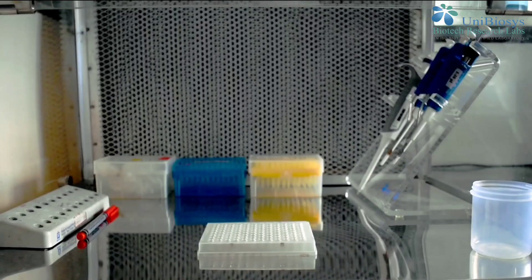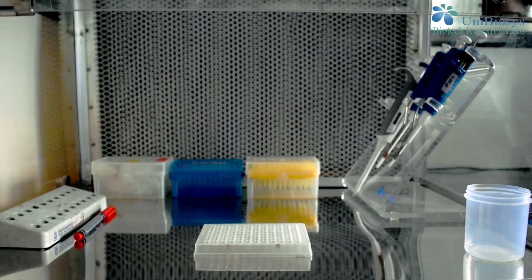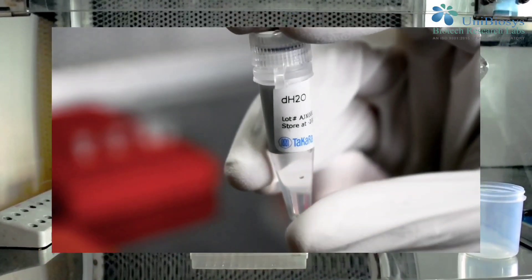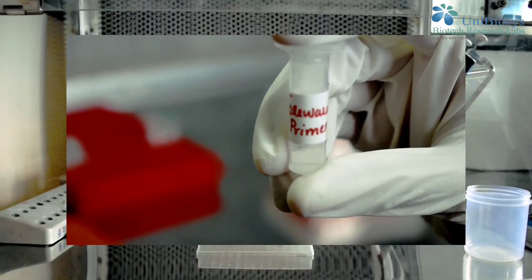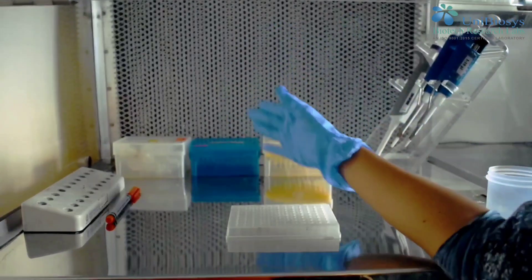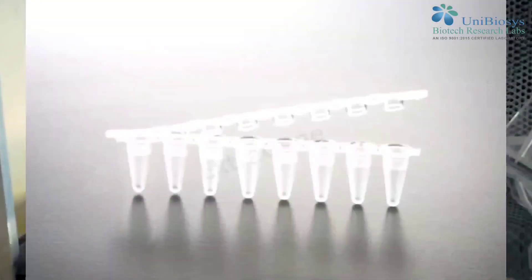Now let's go through the experimental part. These are the requirements for the experiment: RNase-free distilled water, master mix, primers, template DNA, micropipette, pipette tips, thermocycler, and PCR tubes.